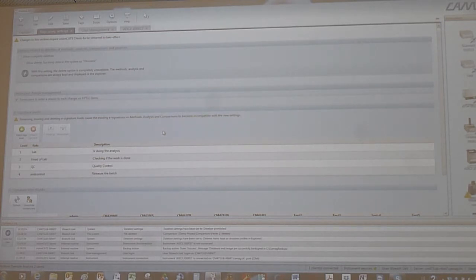And you could mix them and do them and undo them, whatever you wanted. Here now it is more strict: we have up to 5 levels, and these levels have to be followed for the analysis to be fully designed. Therefore, I created 4 levels here, so not all levels. Usually, I think most companies will have 1, maybe 3 levels.